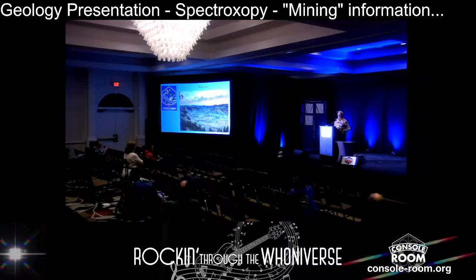I haven't been following it other than, is that the one that landed in Utah? Yeah. I've seen a little bit of that story, but it's been coming out right now, all the information on the different things they've been finding. Pre-amino acid stuff, yeah. Not with this equipment. Not organics. We can see oxygen. We could see nitrogen, if it was there. We don't look for that, in a sense. But it's an exciting time.